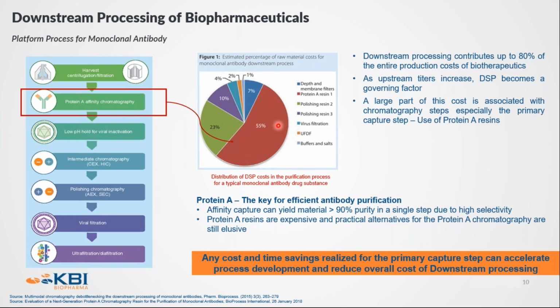Now, if I split up the unit operations involved in the downstream purification of mAb, we see that a major portion of that cost can be attributed to a single step, and that is the protein A chromatography step. The reason is that these resins are really expensive. People have been trying for many years to come up with an alternative, but so far we have not been able to replace the protein A resins just because they are so efficient and they can provide a pure stream greater than 90% purity in a single step.